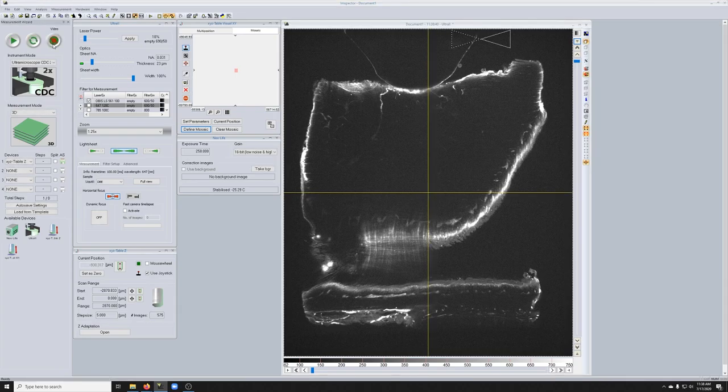Again, that's kind of an option to get good images.